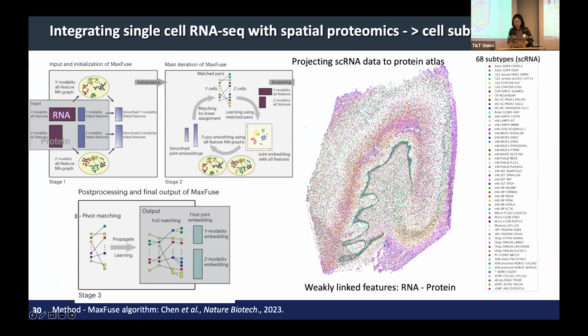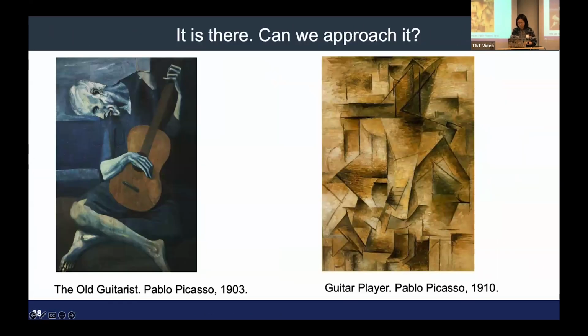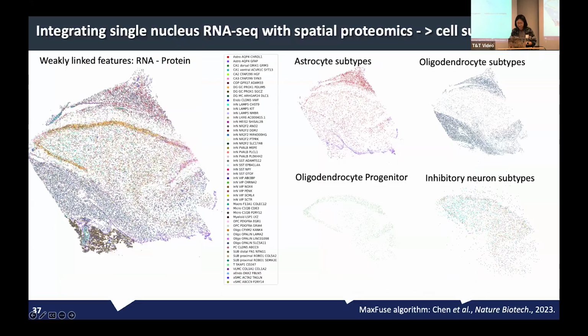We also tried another control sample where you can project all of the subtypes in astrocytes. The purple is one type of astrocyte, the pink or red is another subtype. But for inhibitory neurons, it's a mixture of multiple inhibitory neurons. It's very difficult to validate them. For experiments, it's very difficult, but for RNA, it's easier.